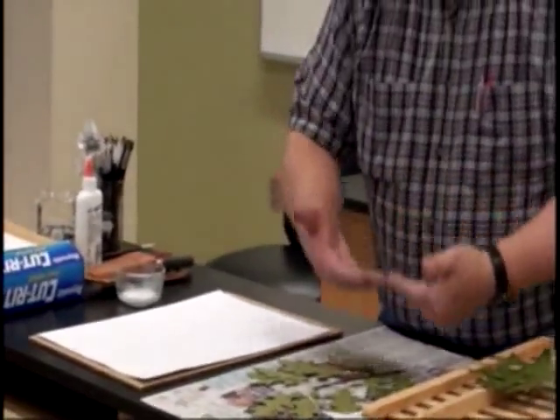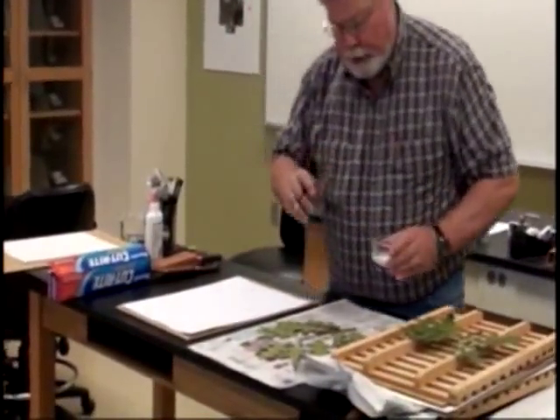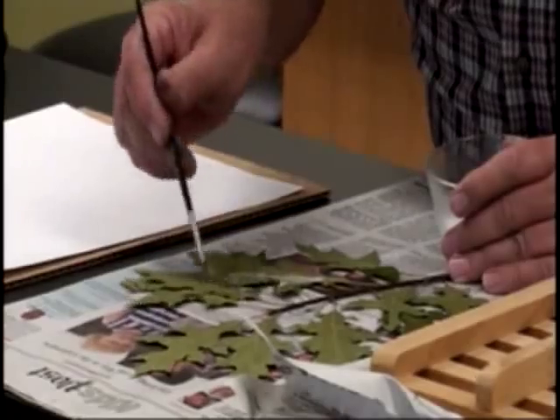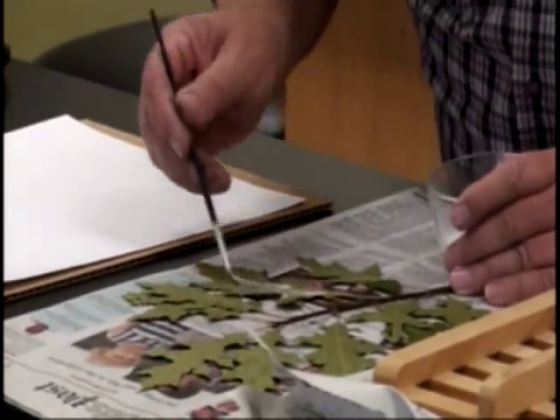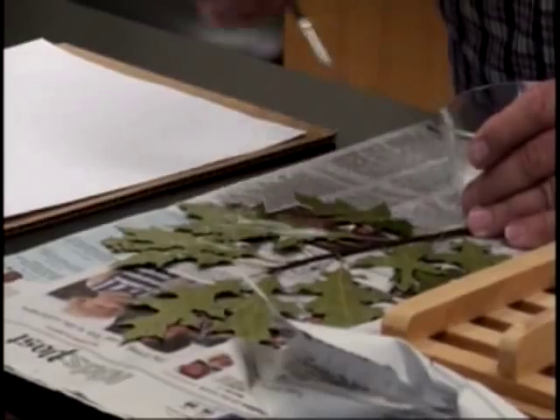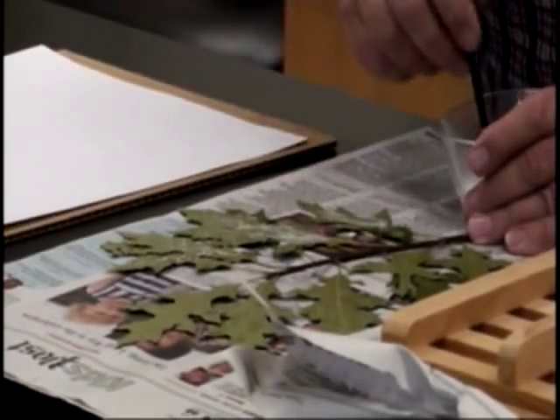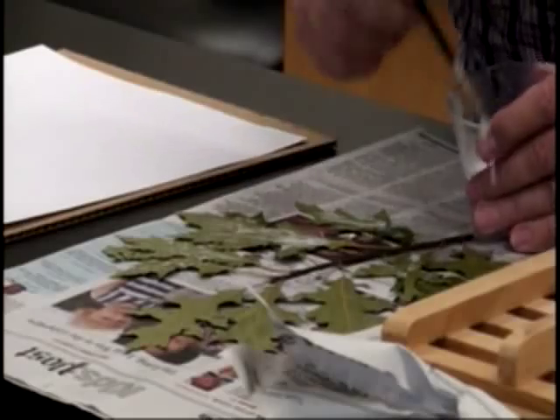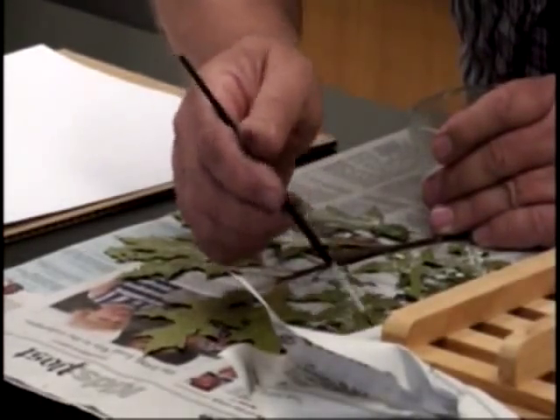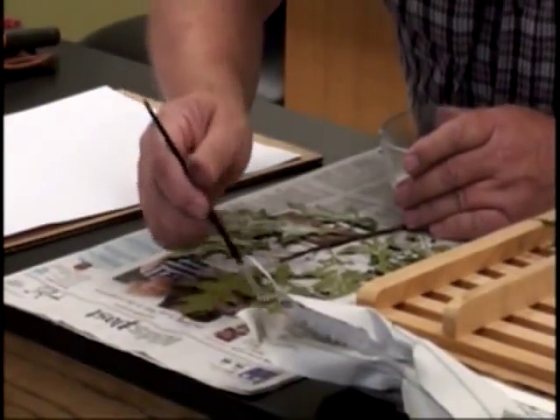Now we turn the plant upside down — obviously we're going to glue it on the bottom side. Take a brush; I've got some very small brushes, but you can use a little bigger brush if you desire. All you do is paint the bottom side of the leaves, stems, and everything with glue. You want to cover as much of the surfaces as you can, but you obviously don't want to overdo it, so that when you turn it back right-side up, glue comes seeping out onto your paper. Do this on a piece of newspaper or some paper you don't mind getting messed up, because you're going to slop a little bit of glue.